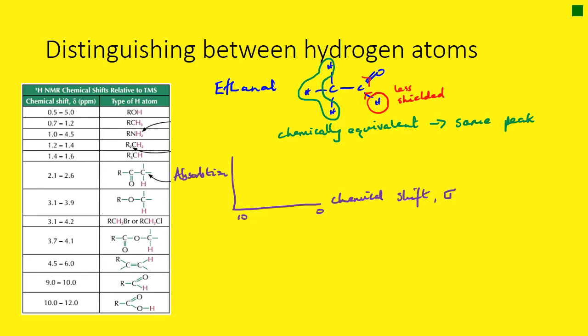And so we've got the red hydrogen to work out first. So the red hydrogen, I'm going to circle on this chart here, is going to be connected to a carbon that is double bonded to an oxygen. So I'm going to circle this hydrogen here. So it's connected to a carbon that is, that's wrong.